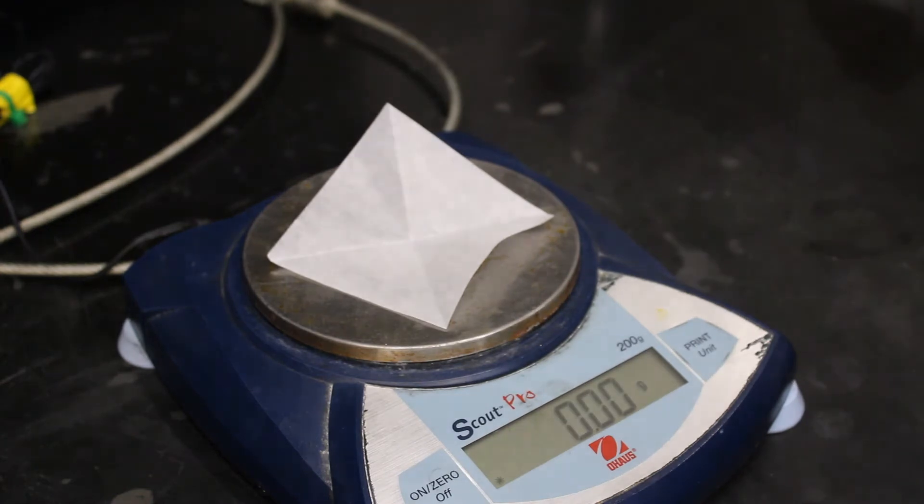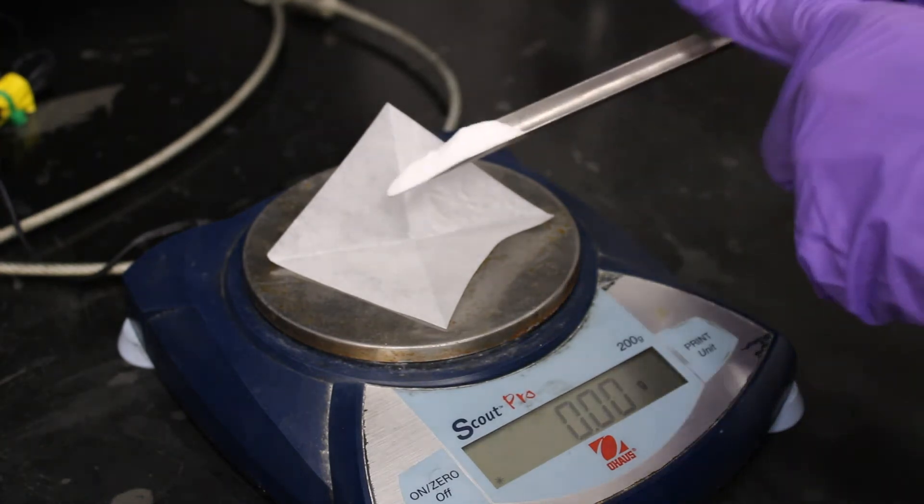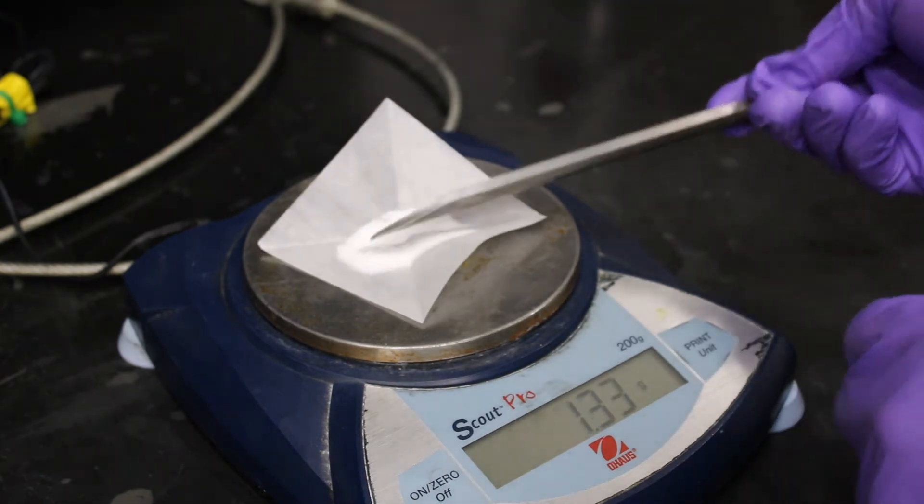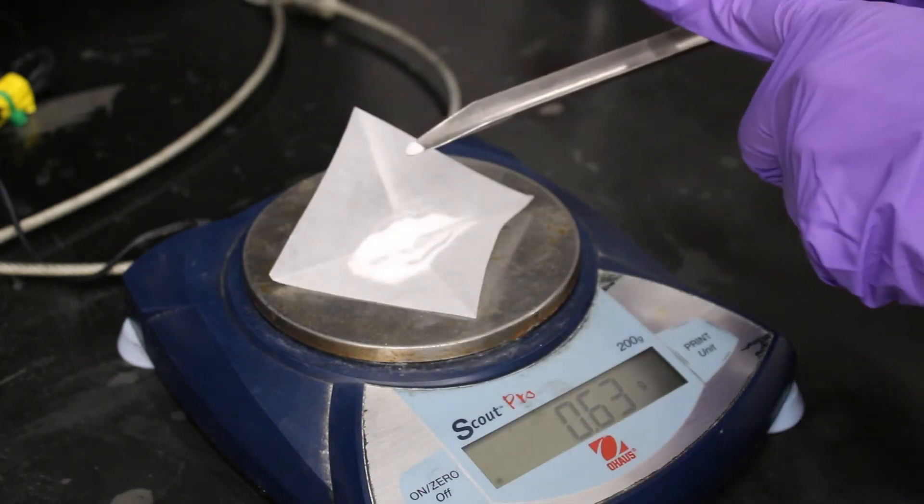Now measure out a sample of sodium bicarbonate using the weighing paper just like before. Refer to your lab manual for the mass needed for each run of the reaction.